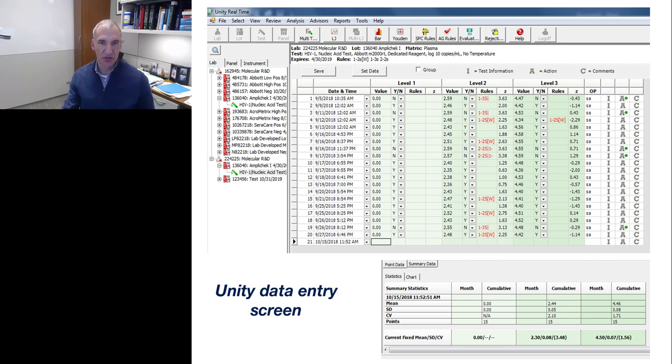We had, as I told you, we had to enter that data and manually track and process it. But with Unity, if a Westgard rule rejection is triggered, a pop-up box actually is visible, and the technologist has to enter an appropriate remedial action. So not only do you see the red number that's generated here, what you aren't seeing is that pop-up box. And based on what your laboratory procedures are, specific action needs to be put in place based on that variation.